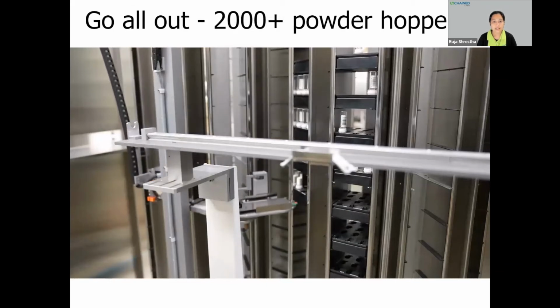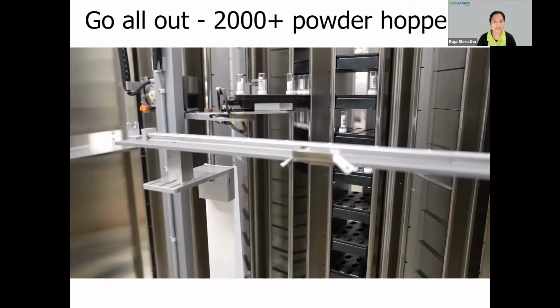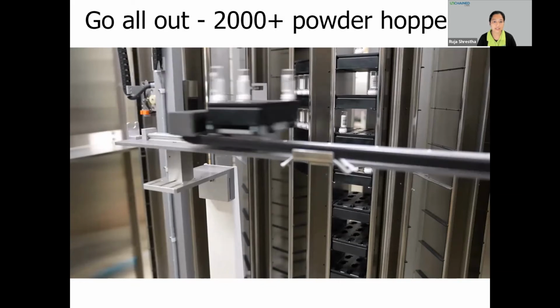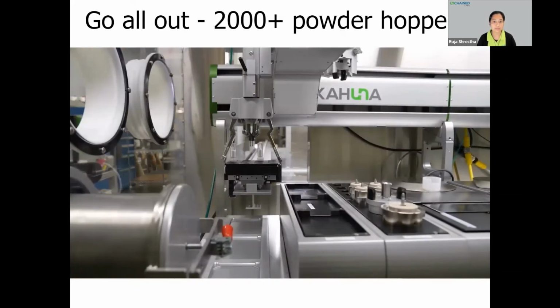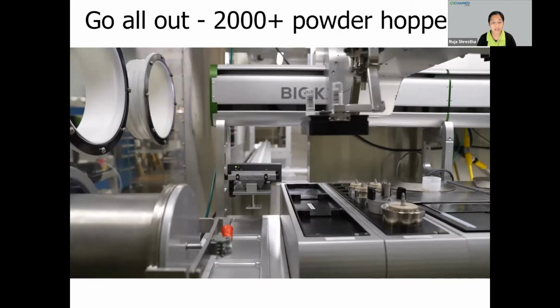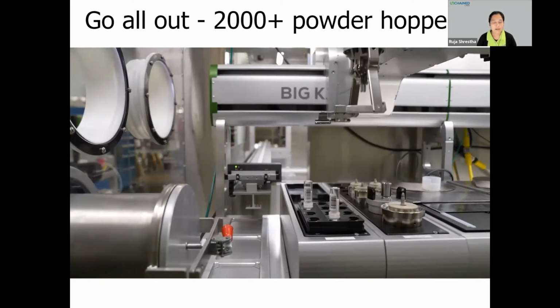For example, this video shows a higher density storage with more than 2,000 SV hoppers integrated with the Big Kahuna system. The desired source rack is pulled out of storage and placed on a plate handoff position on a linear rail, which slides down to a position that is accessible by the plate gripper arm on the robot. In this system, both the storage hotel and the robot are housed inside a glove box to handle air and moisture sensitive materials, and hoppers are barcoded to make sure and confirm that the right source is being retrieved from storage.